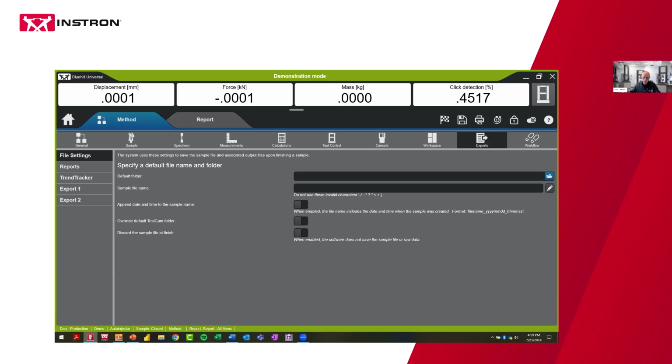That, of course, can be backed up. You do have the option to also save things locally if you don't want to save certain files on the database, but that's the only instance where you'd be left with a system that's connected to Central, and you're storing things on the local system.